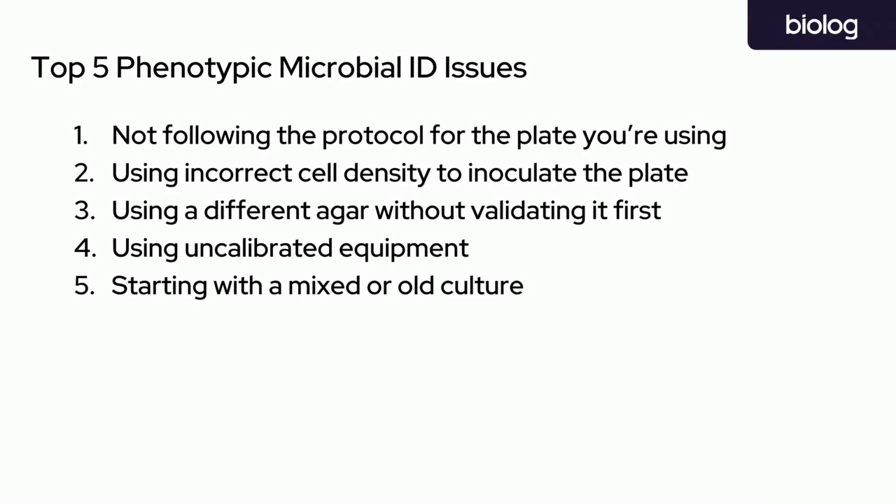So I think Max went through the high level protocols for each plate. And I think one of the biggest things you see, Max, is that people will just skip steps or use a different agar. They think it'll be okay. But in fact, like you said, those protocols were very carefully designed, and so following them is really important. Yeah, so the name of the game is the unified metabolic state here.